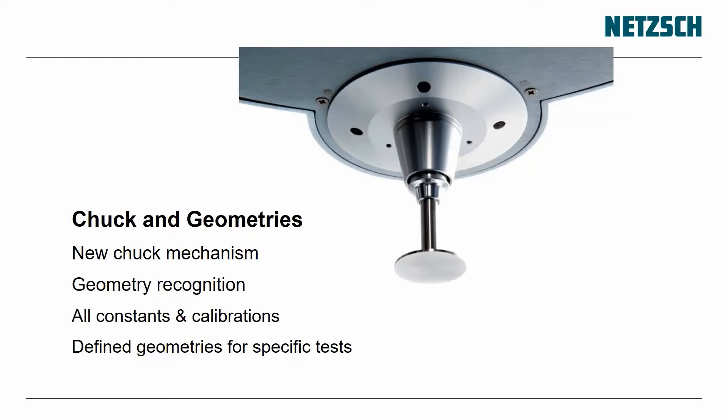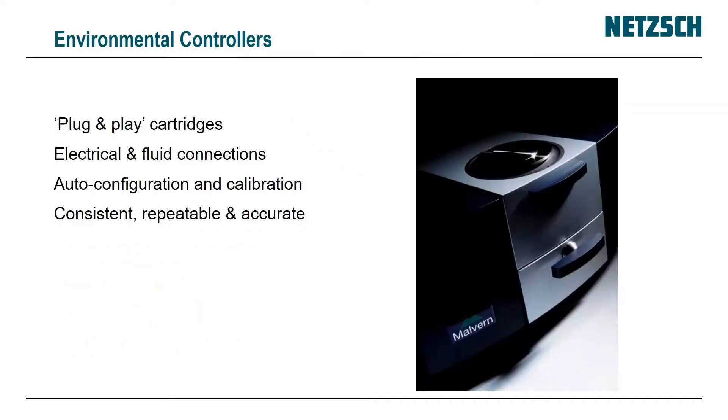The chuck is also redefined. It's a simple chuck — you just push the geometry up into it and it clicks down and clips on. It has automatic geometry recognition, so it identifies what you've put in there, and all the constants and calibrations are uploaded into the instrument. You can even have defined geometries for specific tests.